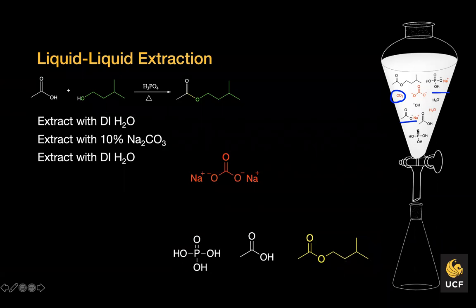Okay, could we use any other base, or should we always use sodium carbonate? Sometimes we use sodium bicarbonate, right? Could we use something like sodium hydroxide? What would happen if we use something like sodium hydroxide in this case? All right, if you have an idea, type it on the chat. Could we use sodium hydroxide in this particular experiment?